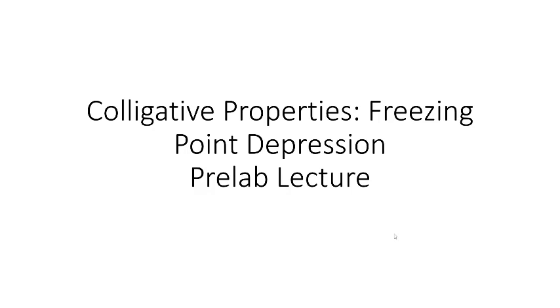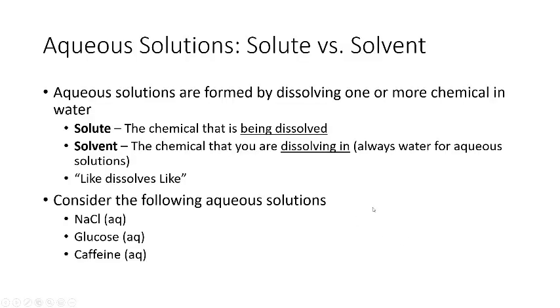Hello, today's video is a pre-lab lecture for colligative properties, freezing point depression. Now, this lab has to do with colligative properties in aqueous solutions. So we just want to establish a baseline real quick as to what actually is an aqueous solution and what components make up an aqueous solution.